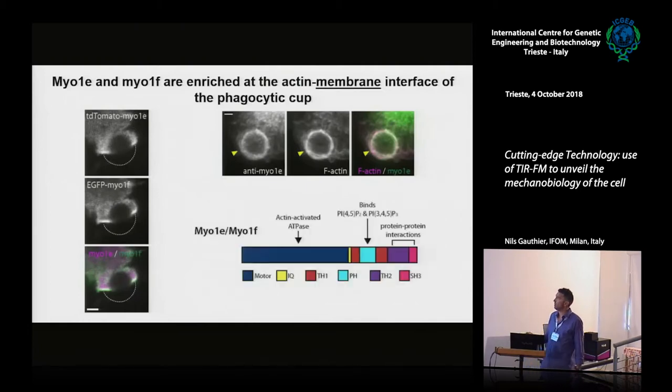Then we have constructs, and what we did also is that we addressed the question here of the binding to the membrane, because so far what we have seen with those techniques is that you look at the actin and we see the colocalization with the actin. Then what's the relationship with the membrane?